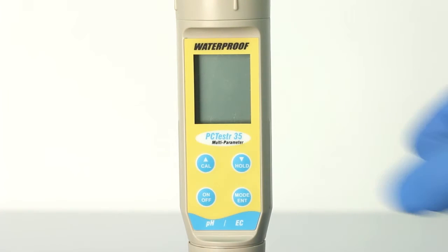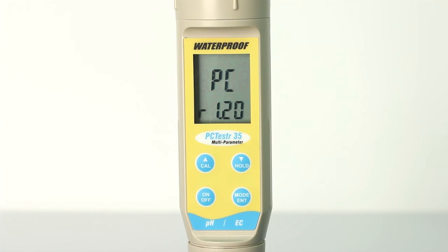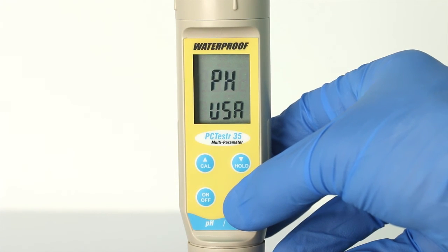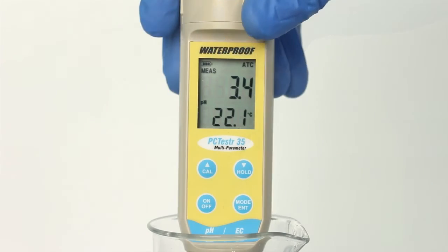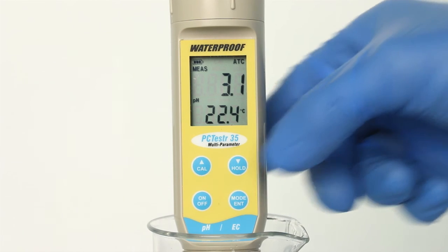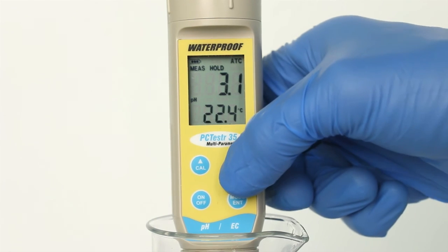Press ON-OFF to turn the meter on, then press MODE ENTER to select either pH or conductivity mode. Fully submerge the sensor in your sample and wait for the reading to stabilize. Note the reading or press HOLD during measurement to freeze the display. The HOLD indicator will display when the reading is held. Press HOLD again to resume live measurement.